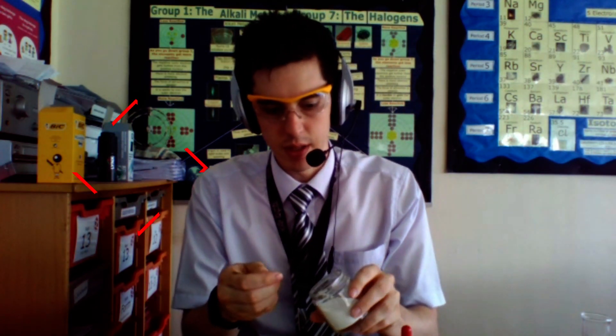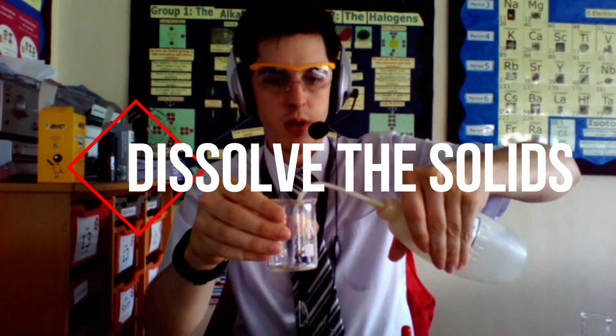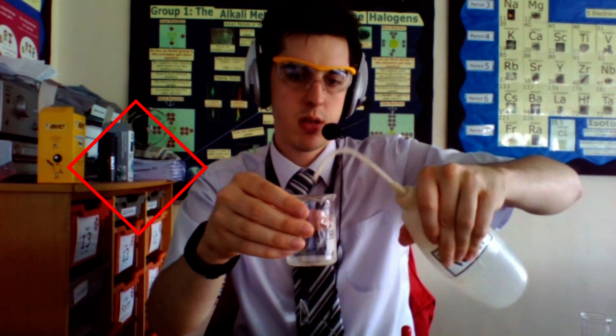So the very first step is to get a spatula of your sodium chloride, dissolve it with a little bit of water and then stir it until it's fully dissolved.